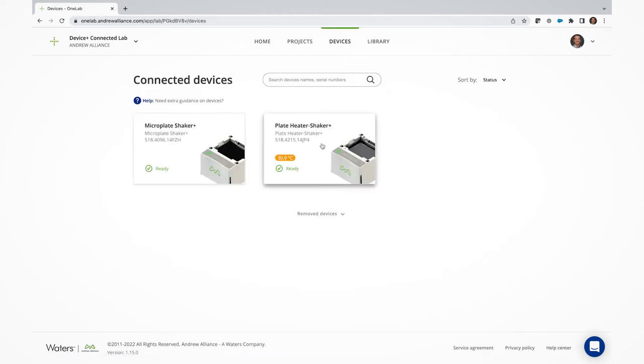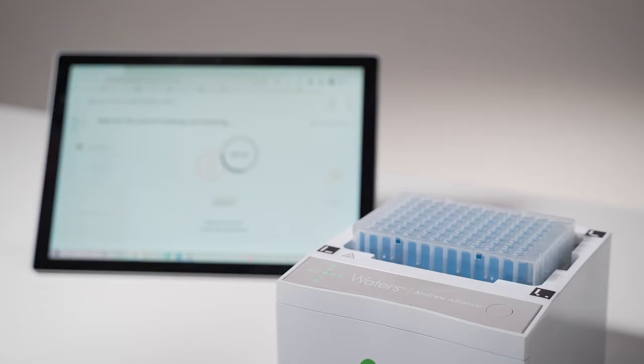Once paired with your lab, the device becomes available in the Devices tab of the software and will automatically be suggested by OneLab during the execution phase of a protocol.